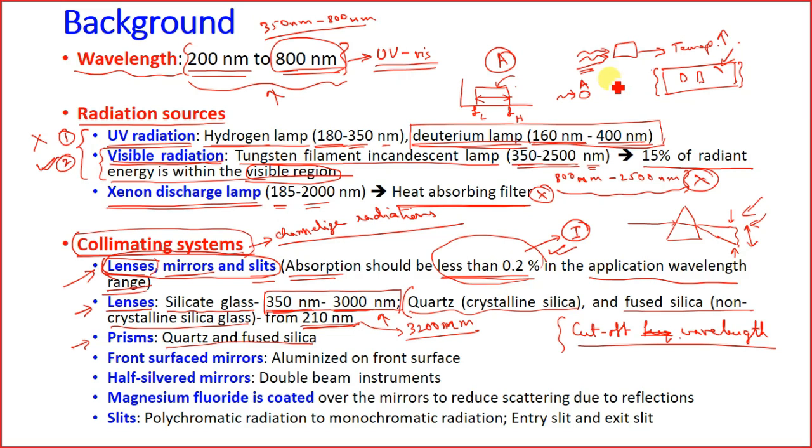If you are creating a wall before the goal, you will allow your teammate to pass through easily, and you will restrict the other team players from passing through the wall quite easily. The same thing happens with the molecule A also. It may allow a specific band of wavelengths, and it will interact in a differential manner.